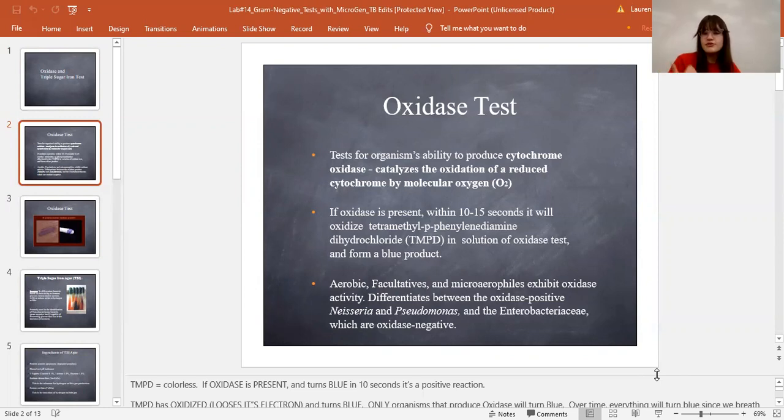This is a mutagen, teratogen, and a carcinogen. So it is bad stuff. If you are watching this in preface for a future lab, or if you are watching this because you are trying to cram for an exam, this is why we want to throw that in a biohazard bin immediately. If you touch that, it is bad news.